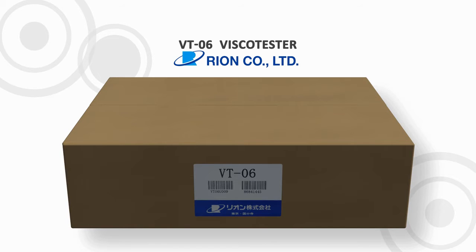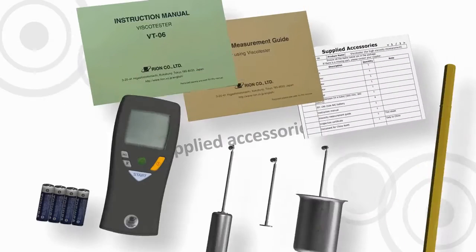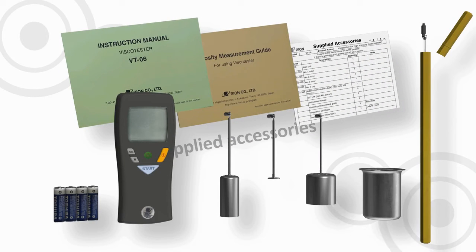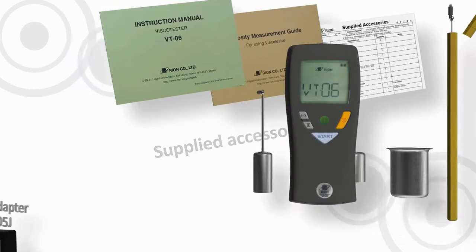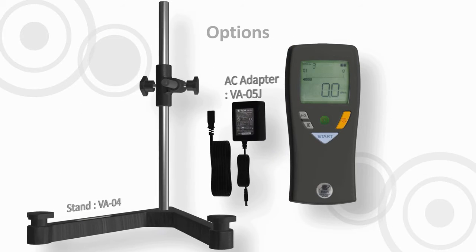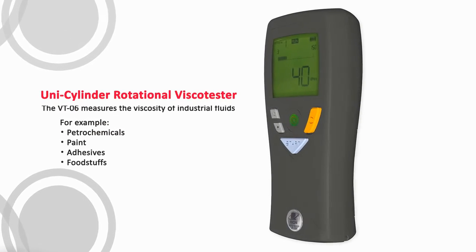The VT-06 Viscotester. These are the supplied accessories. Available options. Unicylinder Rotational Viscotester.